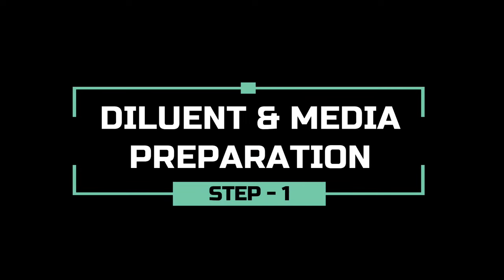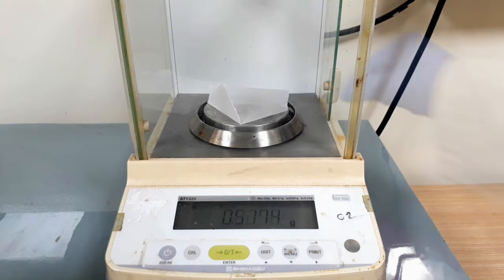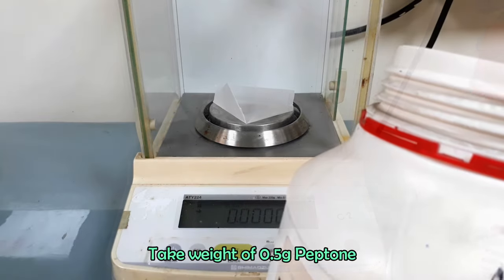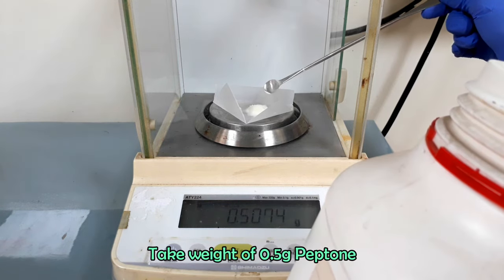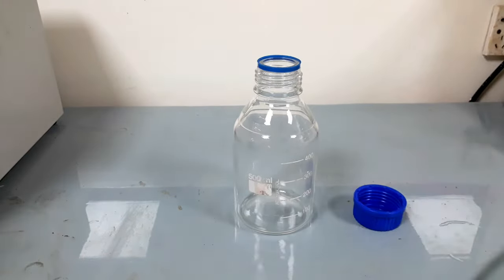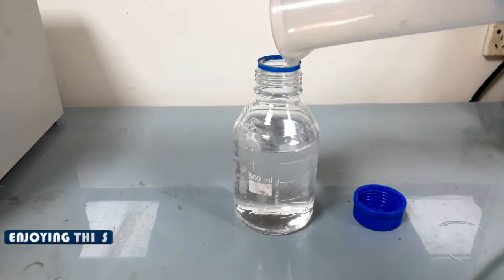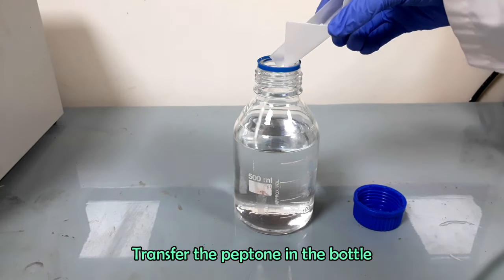At first, we will prepare diluent and culture media. We will use 0.1% peptone water solution as diluent for this test. To prepare 0.1% peptone water solution, take 0.5 gram peptone. Dissolve the peptone in 500 ml distilled water.